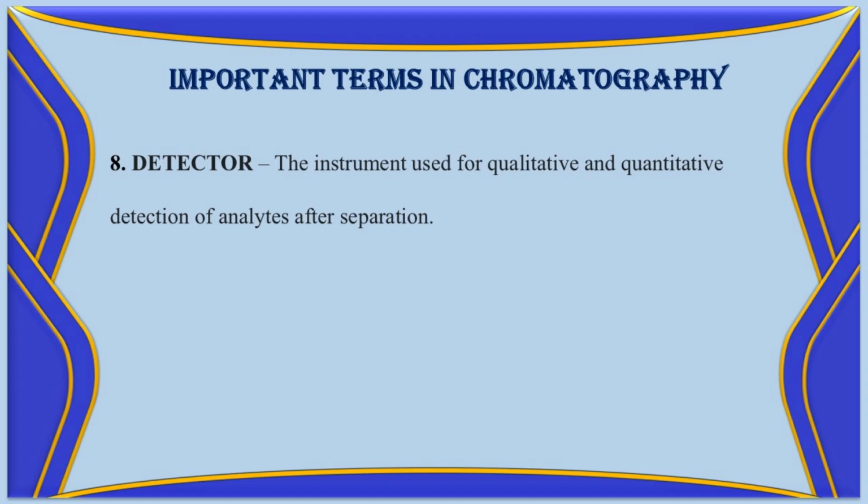The next term in chromatography is detector. The detector is the instrument used for qualitative and quantitative detection of analytes after separation.